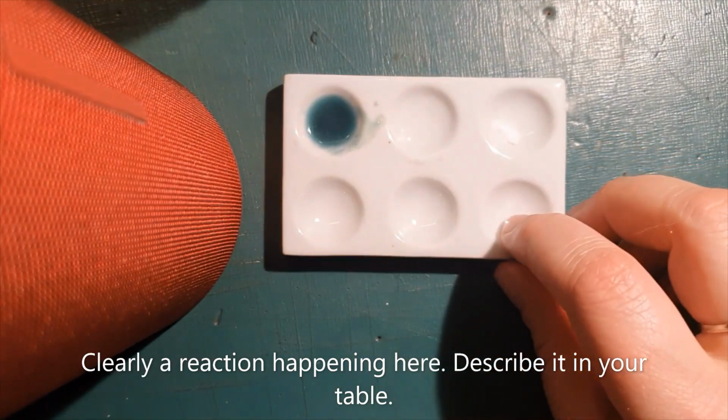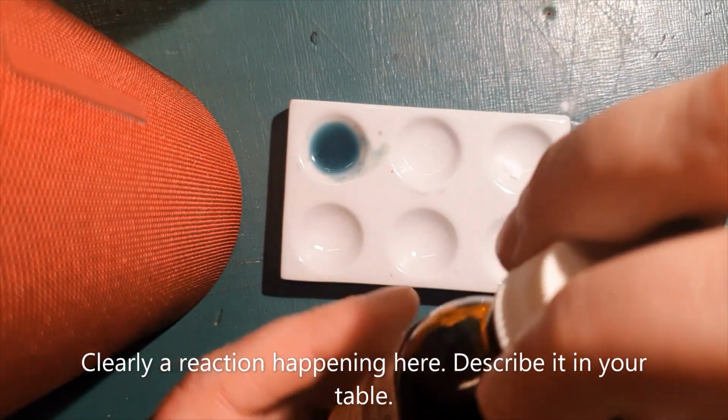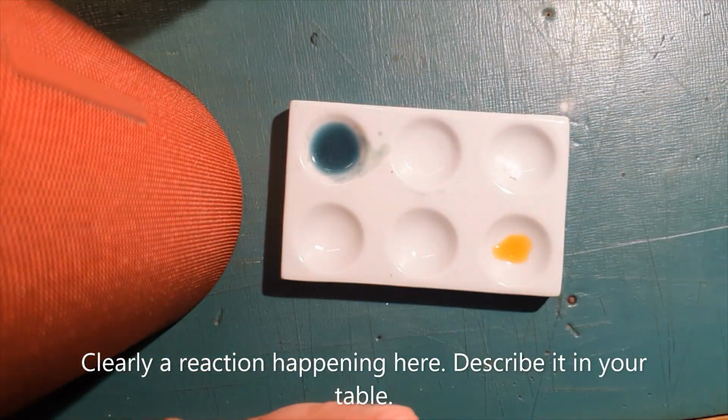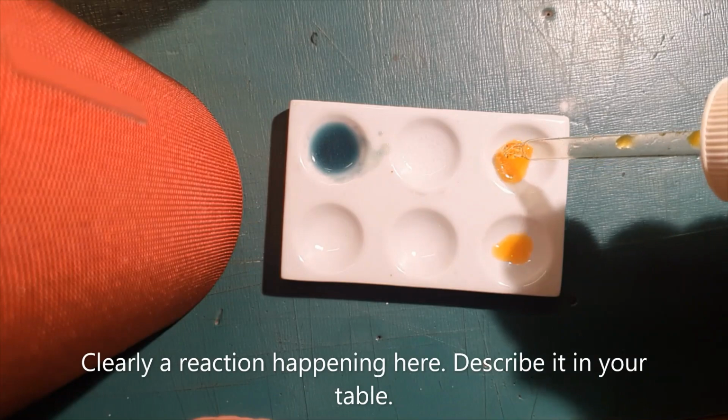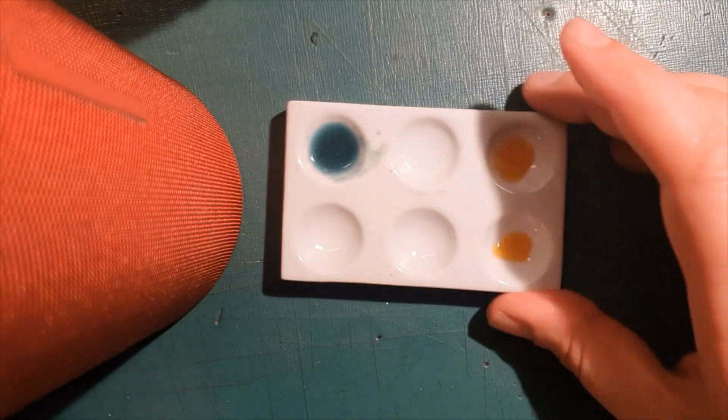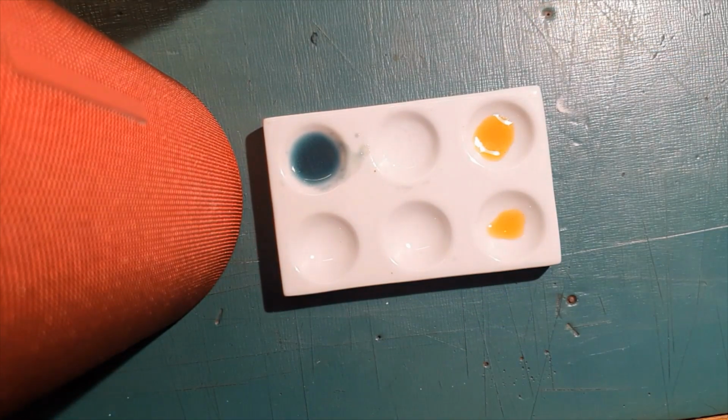Okay, now this one we're going to put some iodine solution. Remember, it's orange, yellow by itself. We'll mix it with baking soda. Also yellow. Okay. So that was baking soda. Next, we're going to do sugar.